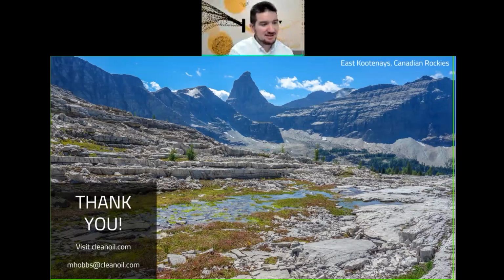What's actually captured on that patch is by definition insoluble, but by letting the oil sample sit for 72 hours, some of the soluble varnish that is present converts to the insoluble form, and then you can capture it on the patch. We also use a non-polar solvent to shock varnish that might have been on the edge of being soluble or insoluble into an insoluble form, so you can see a little bit more of it. In the end, the MPC test does measure both, but it's really only measuring the soluble varnish if you do the 72-hour hold period.